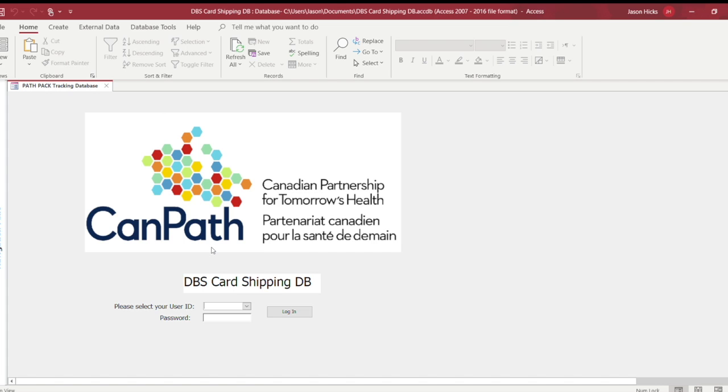Okay, since it wasn't particularly clear in my last video about using the database, I thought I'd do this additional video using an on-screen capture, which will show you more clearly how to use this database and send out dried blood spot cards. So let me log in here.